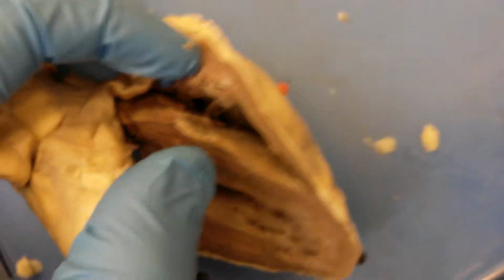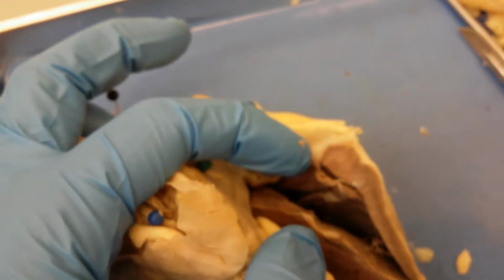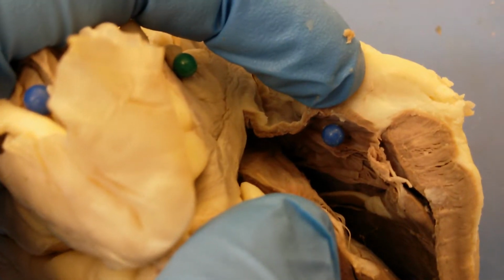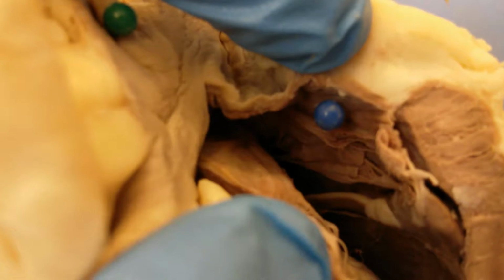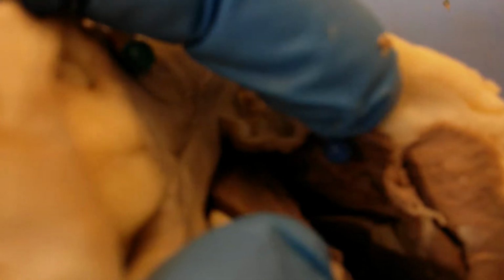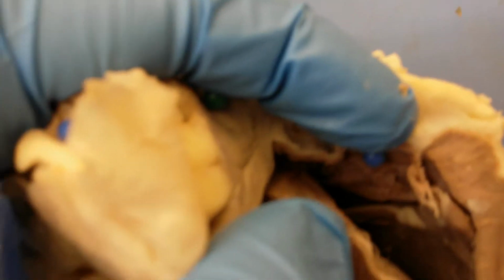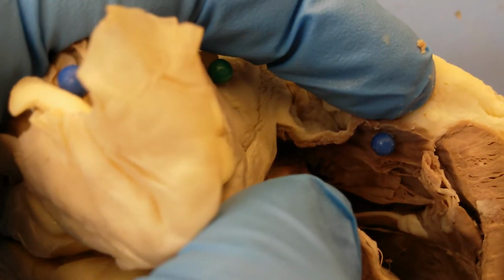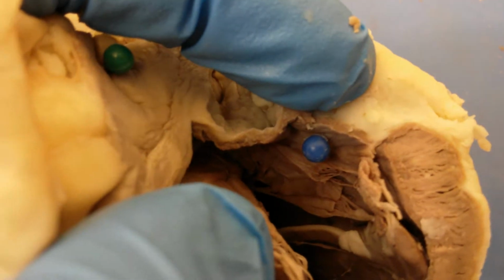Okay, and then if we turn this over to this side, this is looking inside of the right ventricle. You can see inside of the right ventricle, right where that blue pin is, that is the tricuspid valve, right in the middle right now. It's hard to focus.